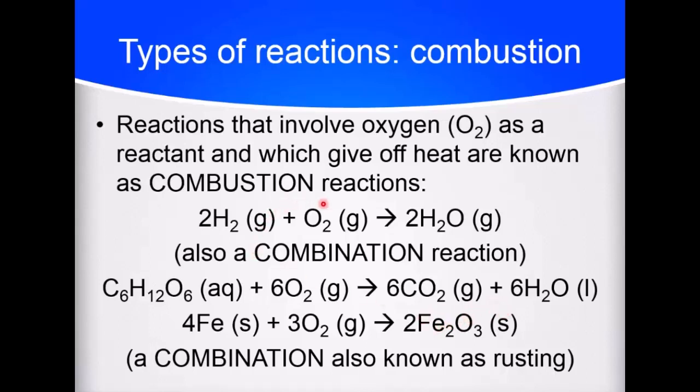So there are a variety of different combining with oxygen reactions which happen in your body, in the environment, in the air, etc., that are definite types of reactions, but recognizing them in the lab could be a little bit challenging, I suppose, other than the fact that the iron looks very different after it rusts. The sugar looks very different after it combusts or is used for energy by combining it with oxygen. The hydrogen and oxygen definitely look different when they are combined to form water. And of course, this reaction would produce a giant fireball as well.